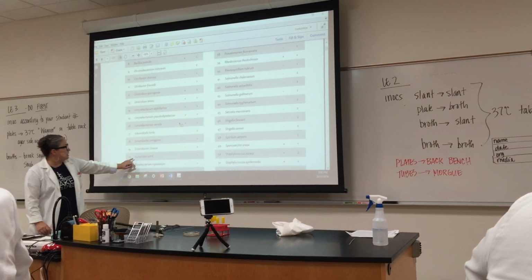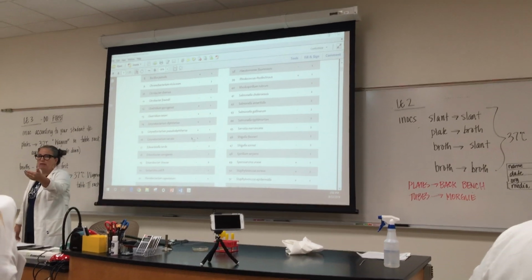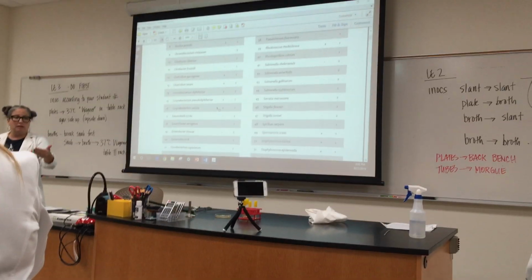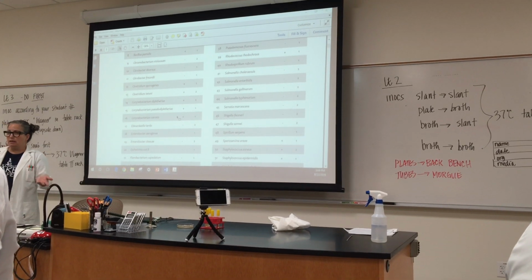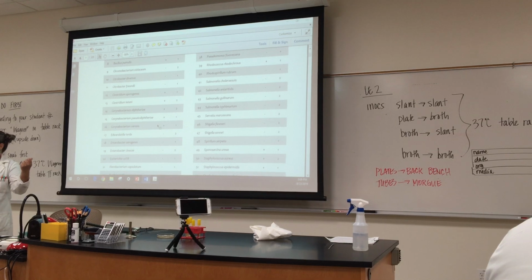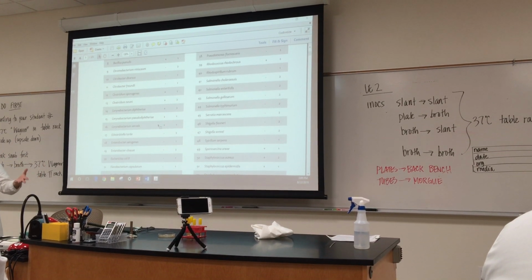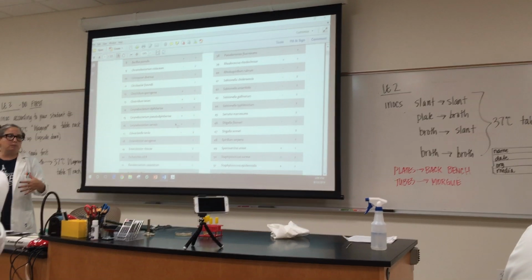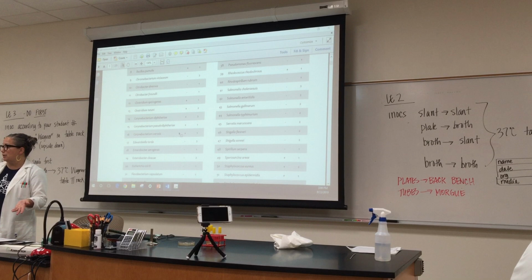and find Escherichia coli, and that is organism 20. So everything will be labeled organism 20 in the back. Now, when you're doing labeling, I would suggest you write E. coli just so that you don't have to later on go figure out what number 20 was. Obviously not a huge thing today because we're only working with one organism, but in the future we will be working with more than one organism, so you'll want to make sure you're grabbing the right numbers in order to do the experiments.